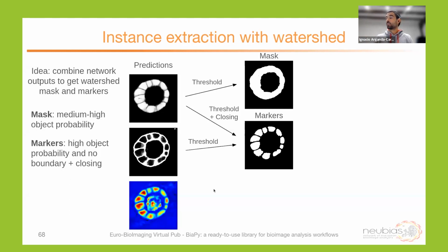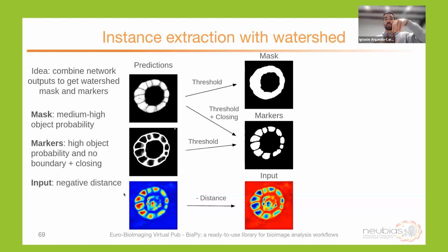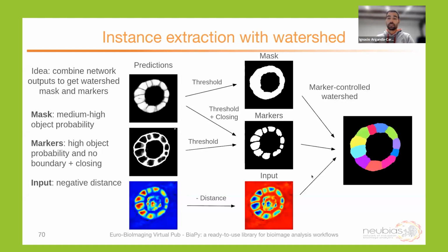And then in the end, we need to run this watershed algorithm in something that looks like a topographical surface. If we use the distance image, we will have the distance to the border. So at the center of the object, we will have peaks, and we said that we want to have valleys, so we can take something like the inverse of the distance. So we do this for our 3D confocal cyst images, and we get very nice final segmentations.